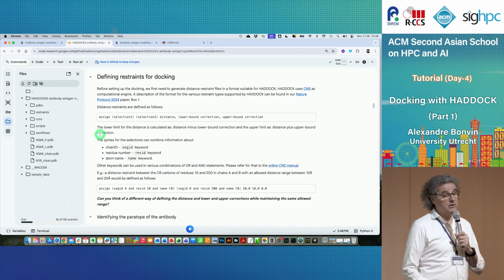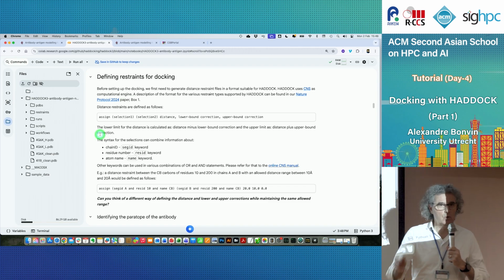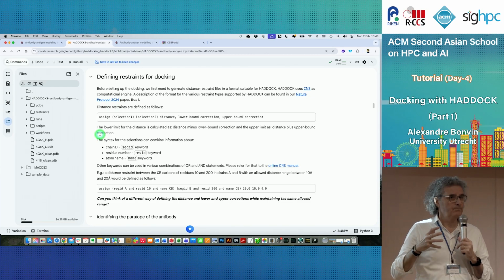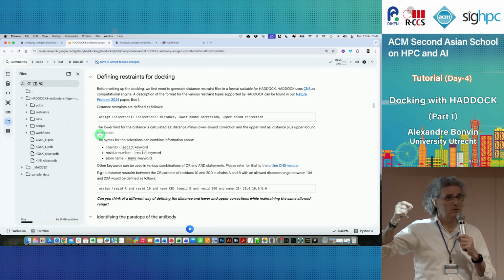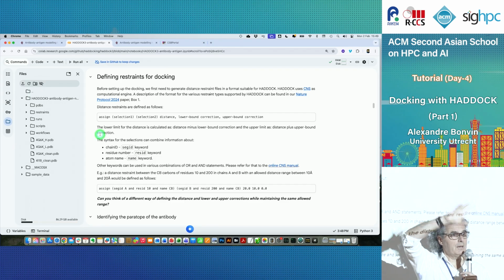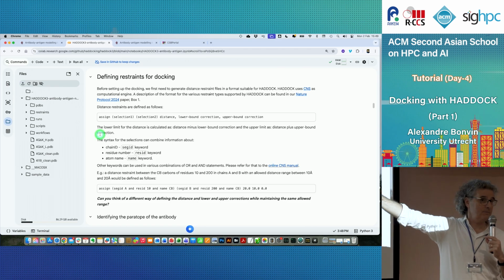So we need to define restraints between those. And in HADDOCK, a restraint is defined... I didn't explain that in my talk, but if you know that an interface is important, and you have two interfaces, how do you bring those together? We don't use a classical distance, in the sense of a distance defined between 2 points. That would be the Cartesian distance, the classical one. Instead we define ambiguous restraints, where we define a first selection. The selection could be one amino acid, meaning all the atoms of that amino acid. The second selection could be a collection of amino acids on the other side.